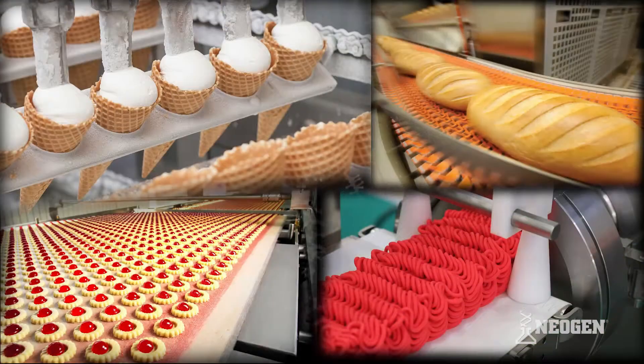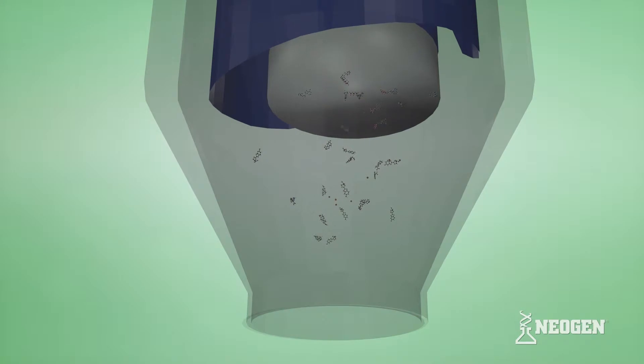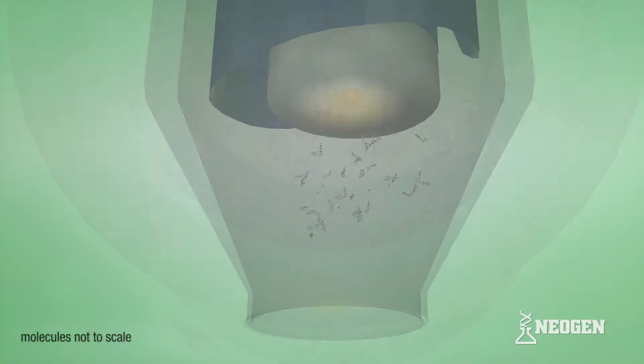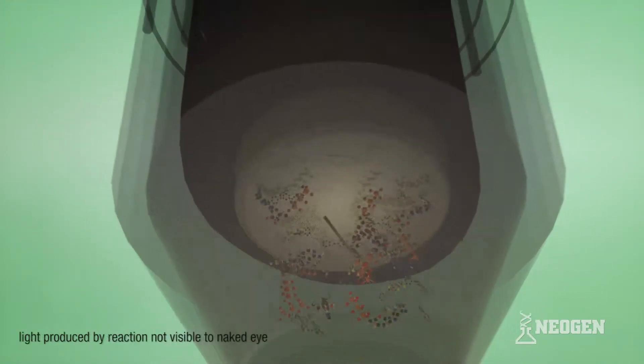Yeasts and molds, and product residue. When ATP reacts with the luciferin and enzyme luciferase in an Accupoint sampler, this produces light.